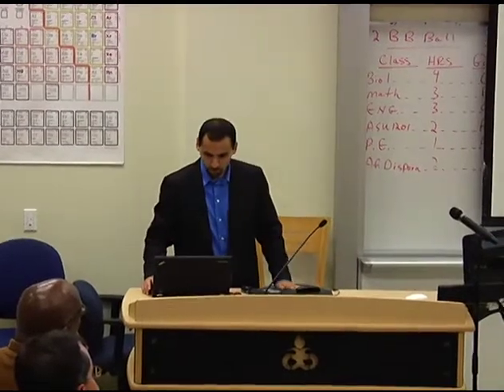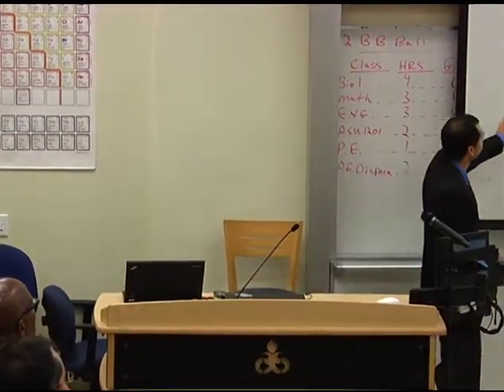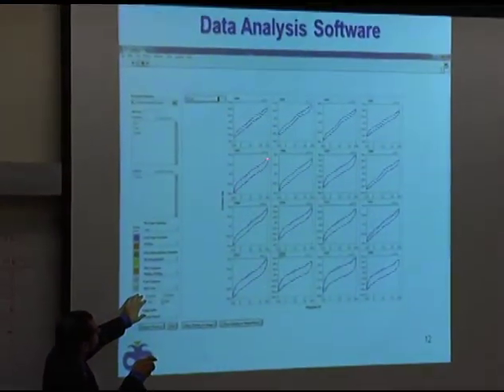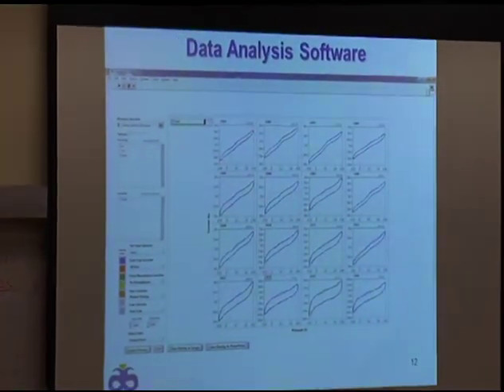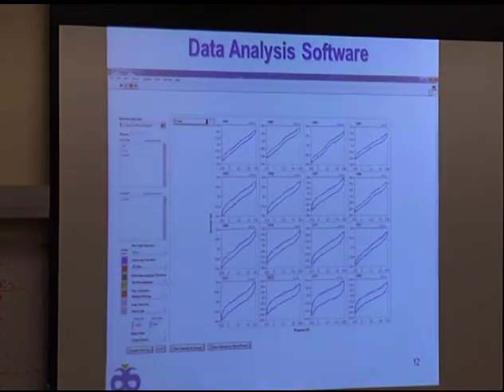So this is the data analysis software. Again, we're using LabVIEW to do the programming here. It was very powerful. We can calculate the exact current under all these curves without having to import the data into Excel, and it does the calculation right then and there for us. So we don't necessarily have to go and do the subtractions. It's already performed using this program.